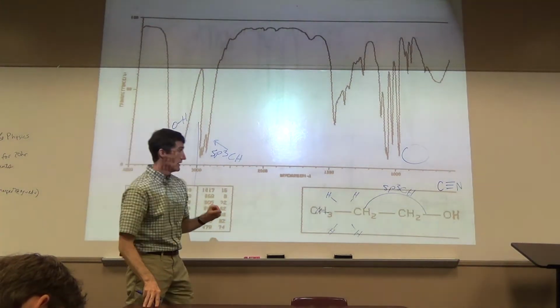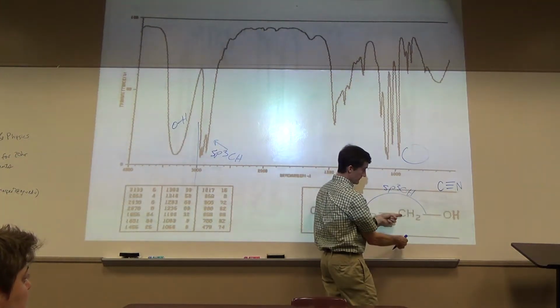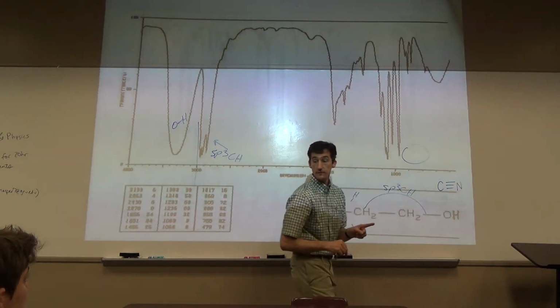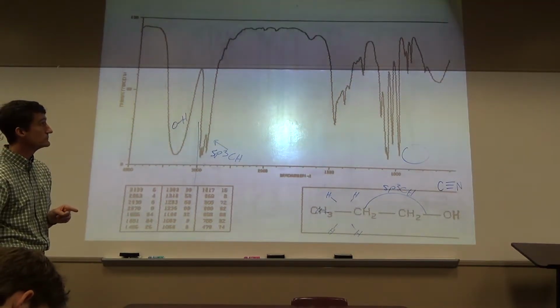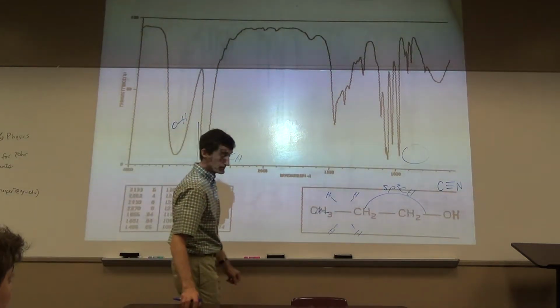CO. Obviously that C is bonded there, these H's are here. Where's the CO? Single bond, fingerprint, right? Right there. That's all we're going to assign.